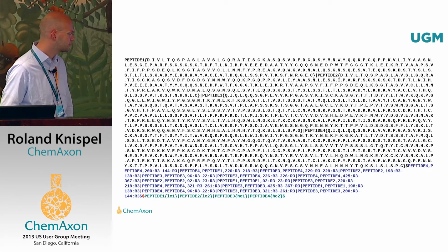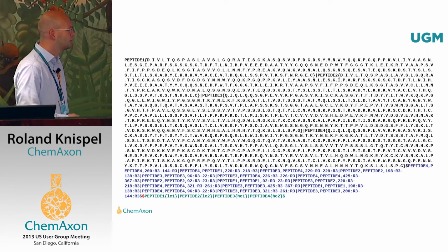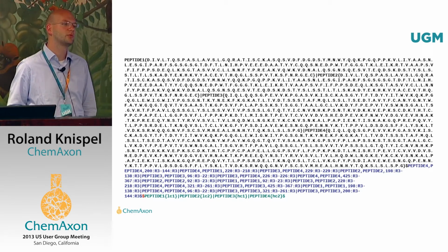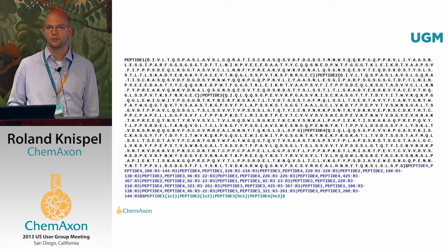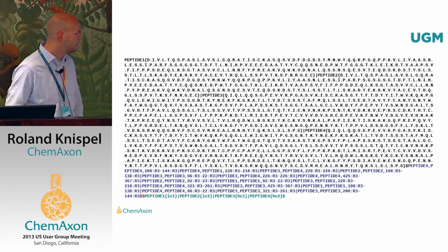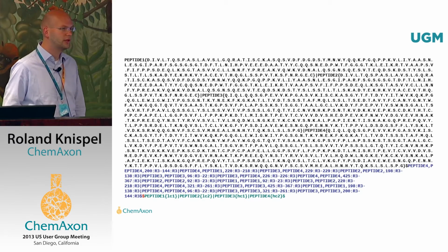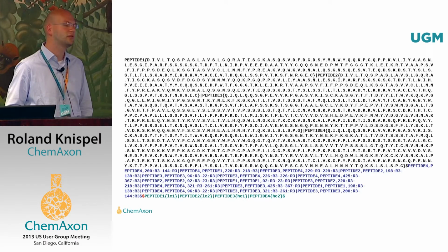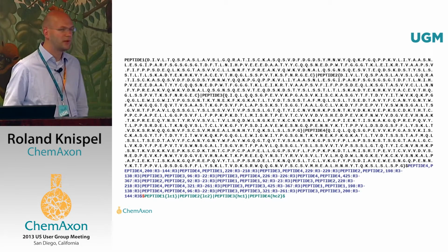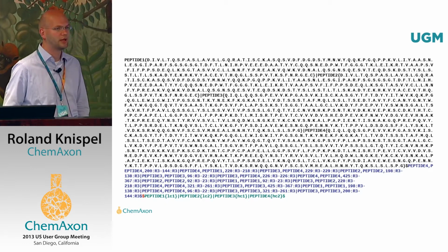notation string. And we used to say that this sort of HELM notation for macromolecules is essentially like the SMILES which you encounter for management of small molecules. So if you're a little bit experienced, you can read it easily. It comes in different sections, which I've colored here, about the individual linear polymers contained in the molecule, and how they are interconnected here in the blue section. And you can even put some annotations back there stating which ones are the light chains and which ones are the heavy chains of my antibody.